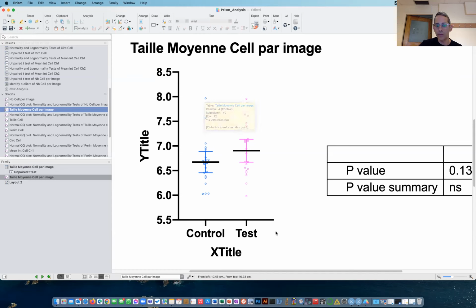So tracing and making your data consistent and reproducible is the main aim of this kind of image analysis. We will discuss it at the next session, which will be dedicated to making figures and writing articles.